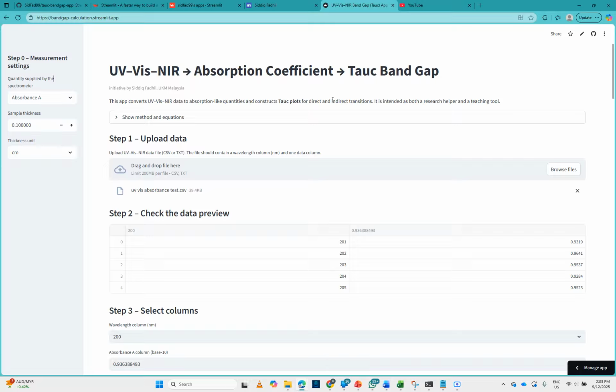No, it's just using this simple app. It's very user friendly, and you just give your data and it can compute everything with exact measurement and exact regression with the R square.